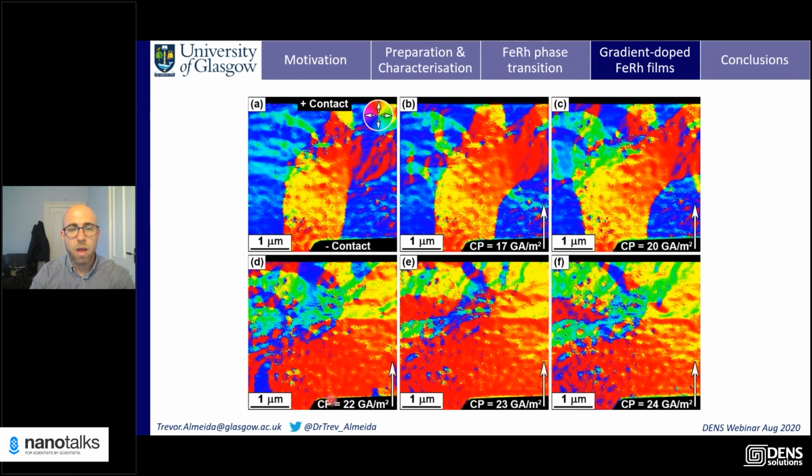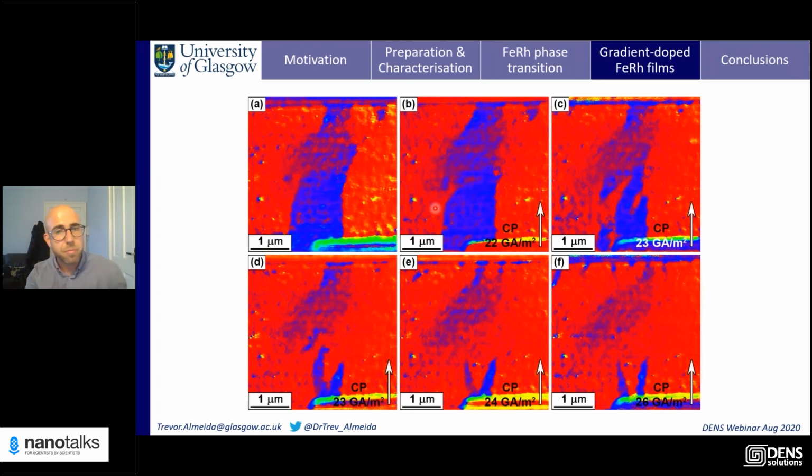And in this case, we can actually see that this domain becomes fully annihilated. We've got some remnants of this domain here. And then as we increase the current pulses, again, we can see that they become annihilated, where most of the domains essentially lie perpendicular, or the domain walls lie perpendicular to the current pulse direction. Which agrees essentially with what I was saying before. Well, hopefully it's not all Joule heating, and it is mainly due to the current pulse direction.